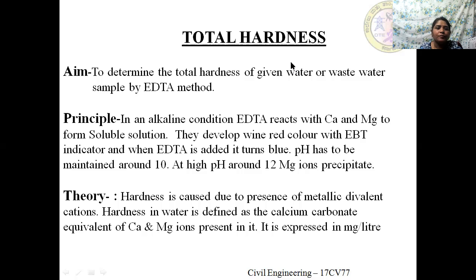What is the aim? We are going to determine the total hardness of any given water sample or wastewater sample by the EDTA method. So what is this EDTA? It is ethylenediaminetetraacetic acid.